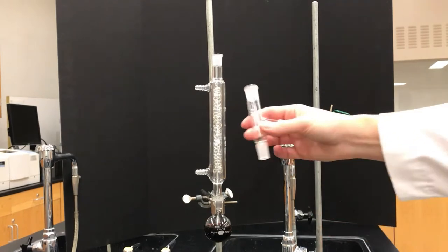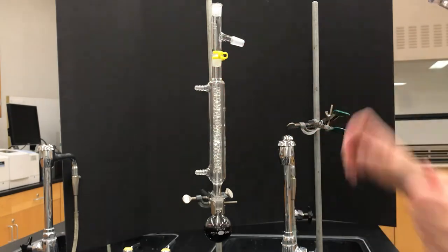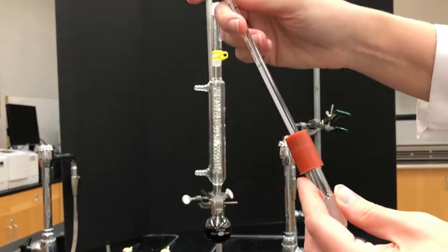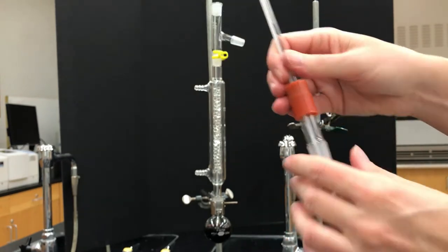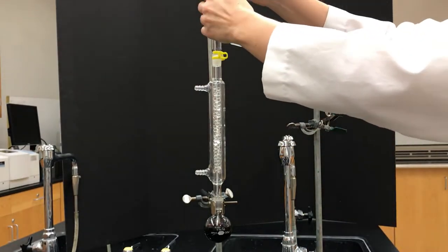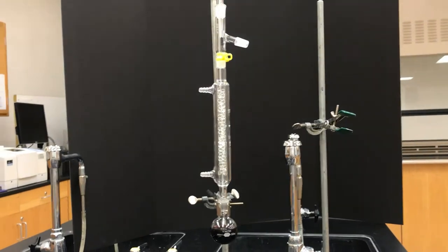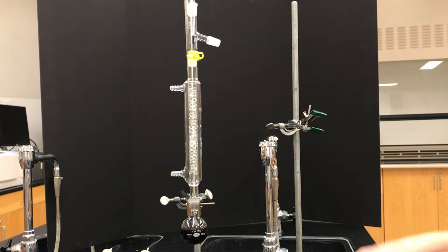And that's the fractional column. Now the rest is the same, so why don't we go fast again. Next goes the three-way adapter and here's our thermometer adapter. We push that in delicately and that goes up there. It just ends up being a really tall setup, that's the main thing. It's just really tall with that fractional column in it.